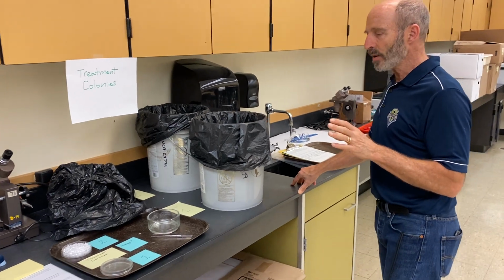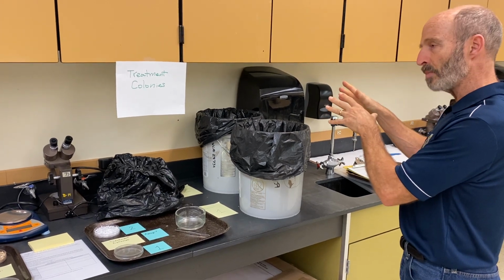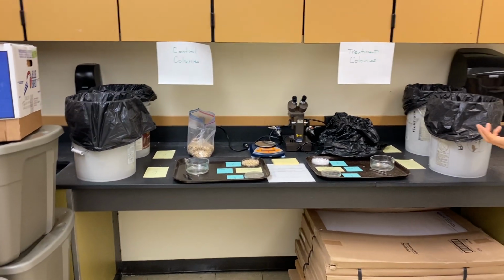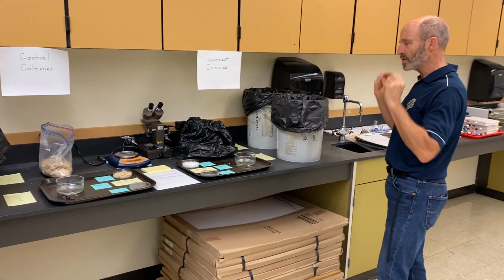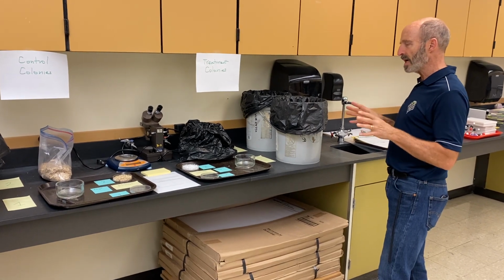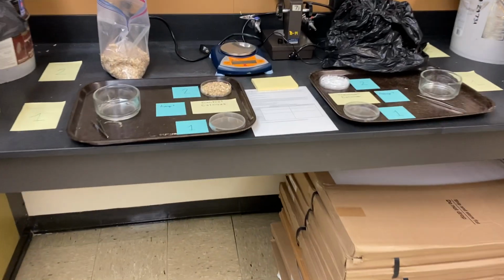What Mr. Brandon and I are going to do here in a minute is we're going to randomly sample from all 4 buckets. So the 2 buckets for the treatment side, the 2 buckets for the control side. We're going to go ahead like we have done. We will have a count for the total number of individual mealworms regardless of their life stages, and then we'll mass them as well. But once again, remember that you're going to need to average data from the 2 buckets so that you have the best data.